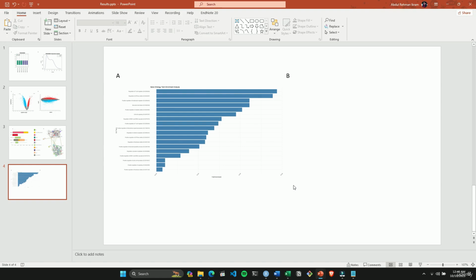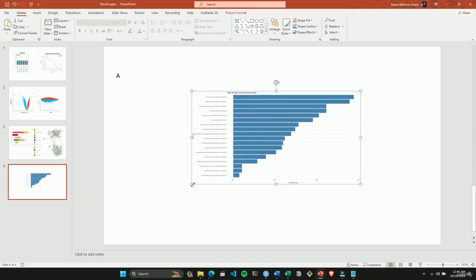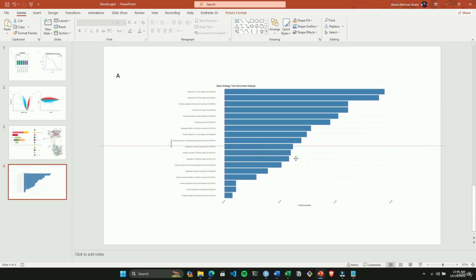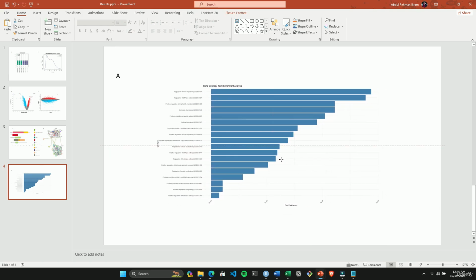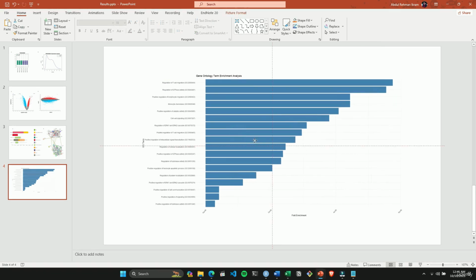I will make sure that this code is presented on my GitHub repository as well. But for now, for this paper, I'm just going to leave it like this, because I think the biological processes are enough for this paper. So here we will leave this like this.